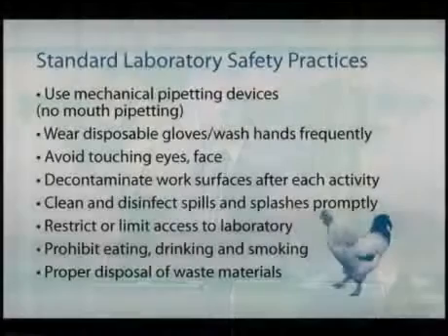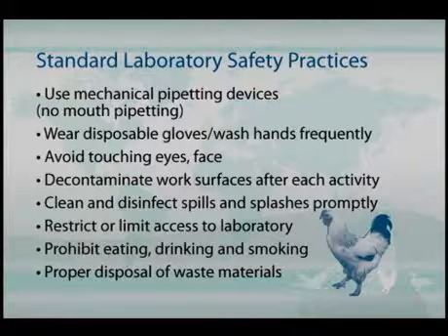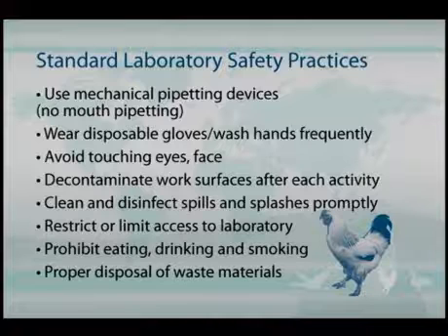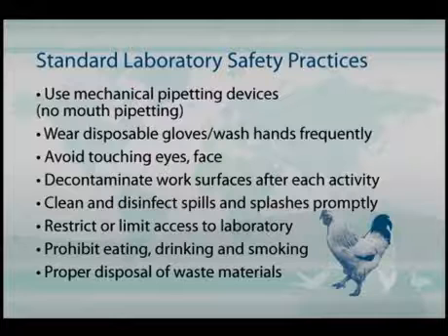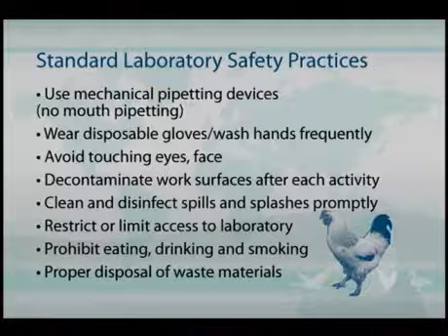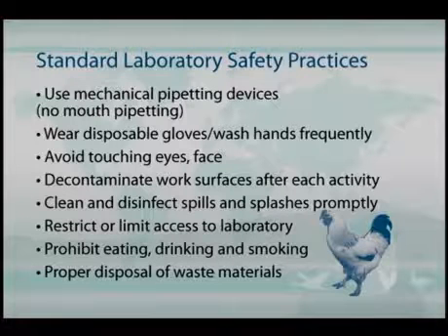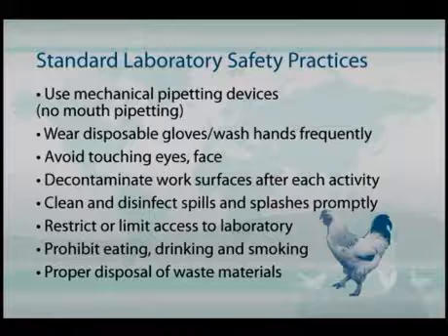Now, some of the standard laboratory safety practices that should be used in most any diagnostic laboratory: of course, no mouth pipetting should be allowed. Mechanical devices are always used to manipulate samples in the laboratory. Disposable gloves and the washing of hands frequently prevent possible exposure when you move your hands around your face or eyes, etc. But you also should not touch your eyes or your face while working, certainly within the cabinet or within a dirty environment.